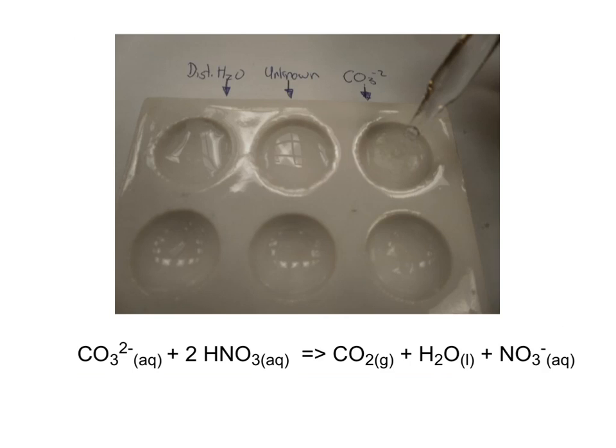If any of these liquids contains carbonate ions, which we know is the case in the third spot, then the carbonate ions will react with the nitric acid to form carbon dioxide gas bubbles. Should our unknown contain carbonate ions as well, we should also be able to observe the formation of gas bubbles. Our distilled water is the blind test just to make sure we work cleanly, and we shouldn't see any gas formation when we add nitric acid to the distilled water.